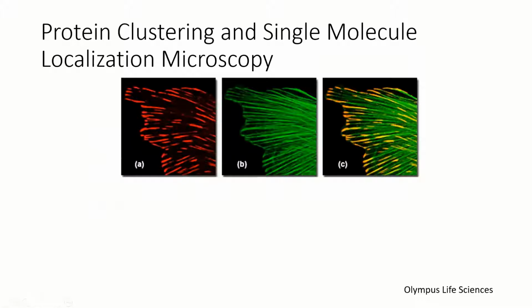Protein interactions and protein-organelle interactions are a hallmark of cellular signaling. Studying proteins that are close together, or proteins that are close to organelles, can help decipher how those proteins impact cellular functions. And by quantifying the degree of clustering of a protein in the cell, or the degree of co-localization between 2 protein populations, we can gain insight into various cellular functions, especially if you start changing cell states.